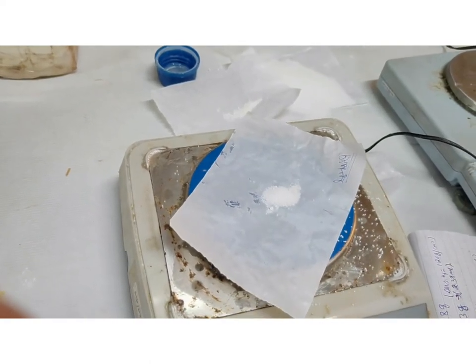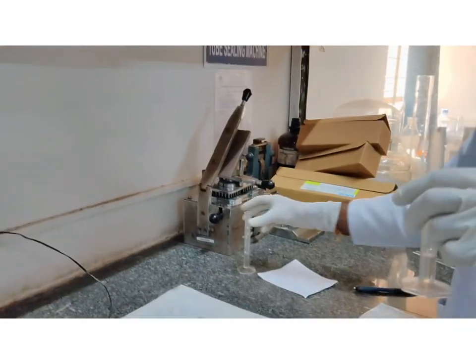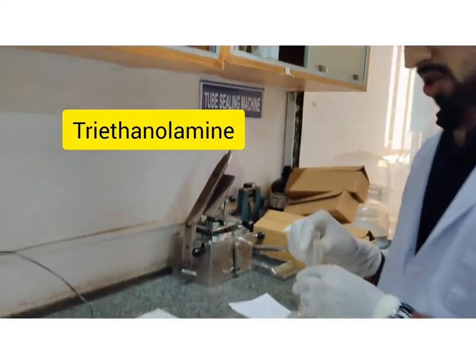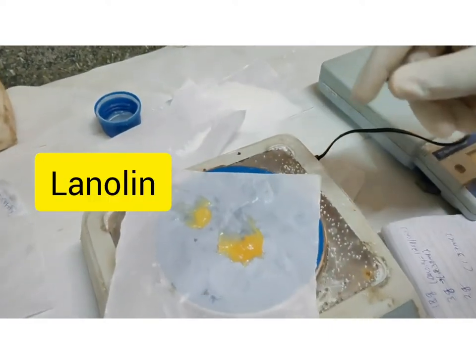And we have taken the glycerin, 2.38ml. And triethanolamine, 1.37ml. At last we have taken the lanolin, which is 2g.